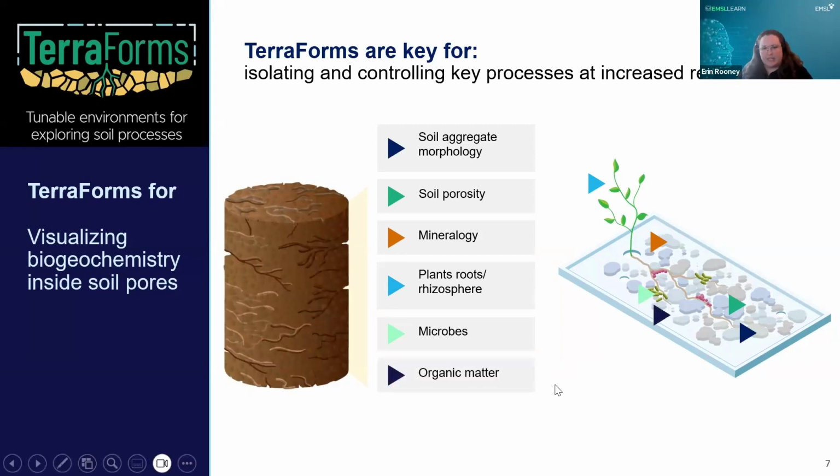So currently, there are a couple different ways that we can create terraforms. They can be homogeneous designs, or they can have heterogeneous and more field realistic structures, but those can be really time consuming to create. And there's something really key that those can miss, which is some pore network characteristics that are becoming more interesting to us with recent research.